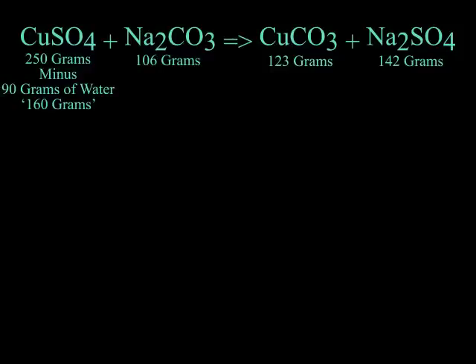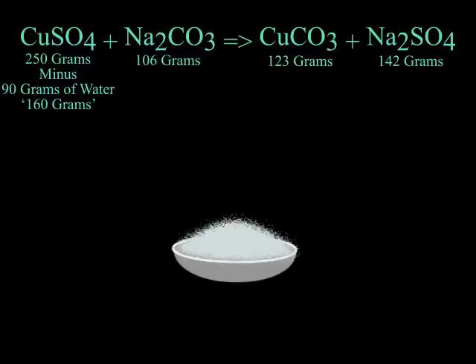To finish our synthesis of copper carbonate, we let it sit until it has settled, and then we decant off the water layer, and then filter and wash with acetone to get rid of any unreacted salts, and help drive off water for drying. After you recover your copper carbonate from your filter paper, and you let it dry, you can powder it, and get it ready for the next step. Thank you, and back to you, Professor.